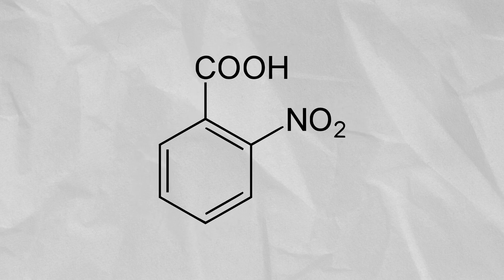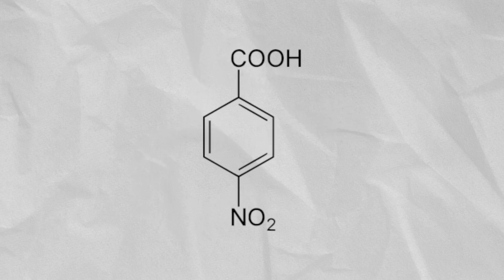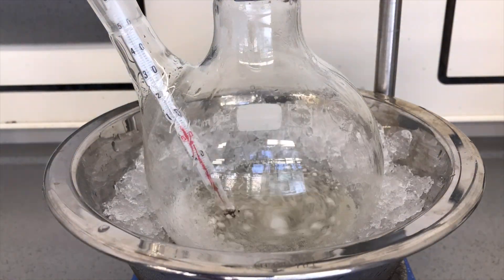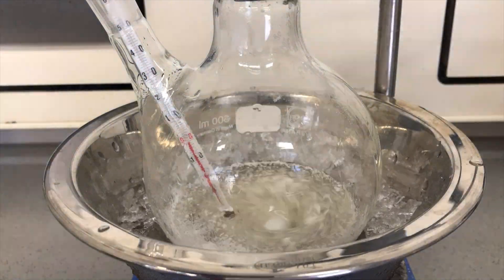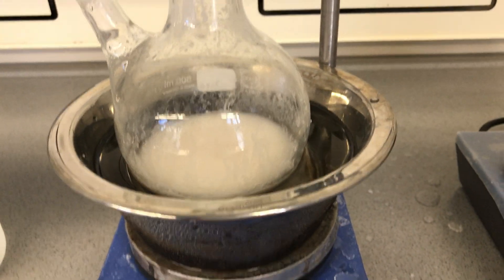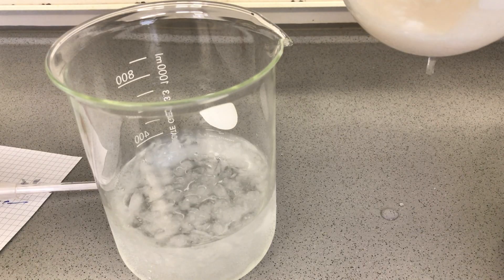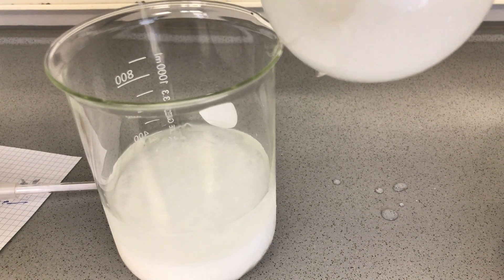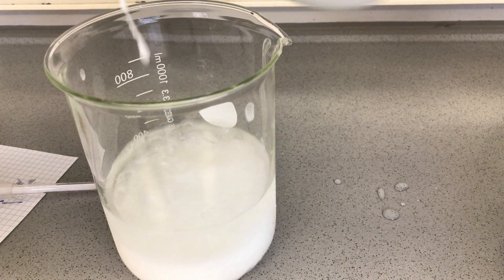About 20% of 2-nitrobenzoic acid and 1.5% of 4-nitrobenzoic acid are also produced. Because we carefully had to monitor the temperature, the reaction itself took a long time. In the end we were left with this white solid mass, which was poured into ice water. The reaction of the sulfuric and nitric acid with the water was pretty exothermic.